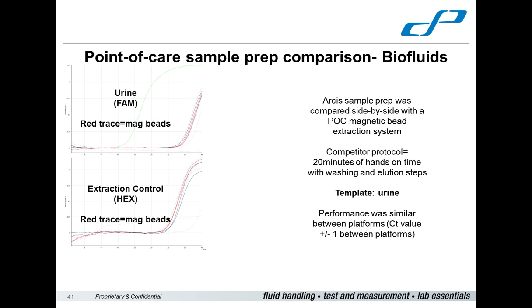And finally, urine. So we got really nice results with urine, and that opens up lots of opportunities. You know, urine is a fantastic liquid biopsy system, increasingly used in diagnosis of human illness, of Mendelian diseases, and indeed of infectious diseases. So we're confident that we can use any human biofluid. We can use them in a laboratory setting. We can use them in a point-of-care setting.